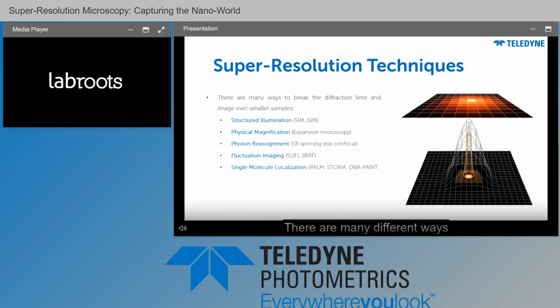There are many different ways to break the diffraction limit, and in this webinar I'm going to cover structured illumination, physical magnification, photon reassignment, fluctuation imaging, and single molecule localization.